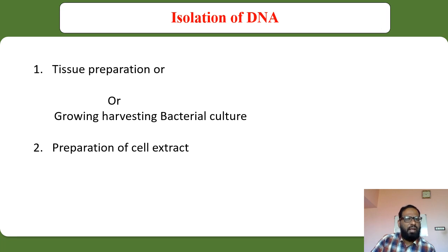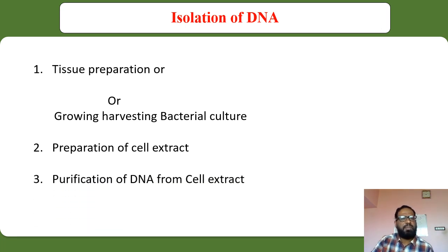Unless you break that particular cell, you are not going to get any content of that cell. That's why you have to break open the cell, and once the cell is broken into pieces, the extract will have DNA as well as other biomolecules. And the next step is called the purification of the DNA from the cell extract.